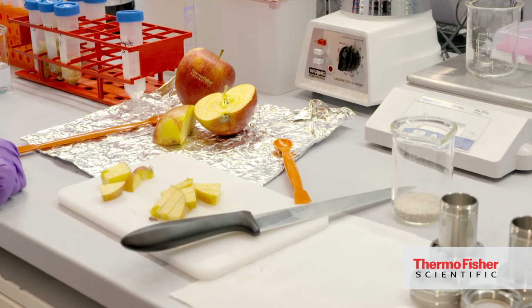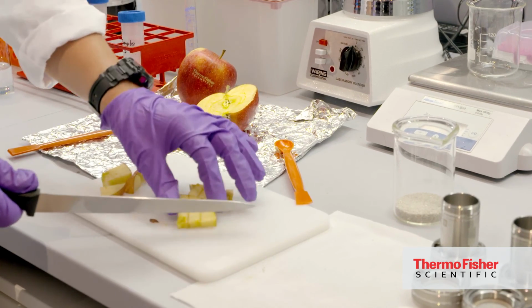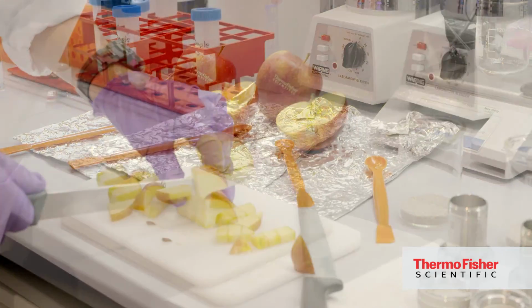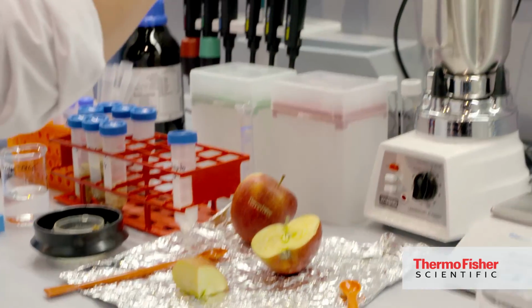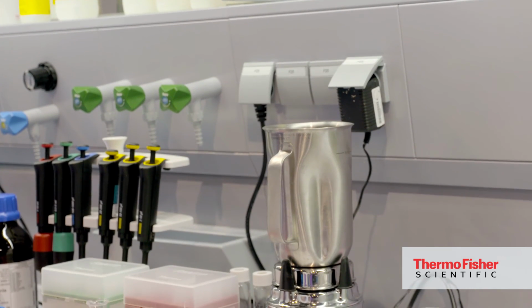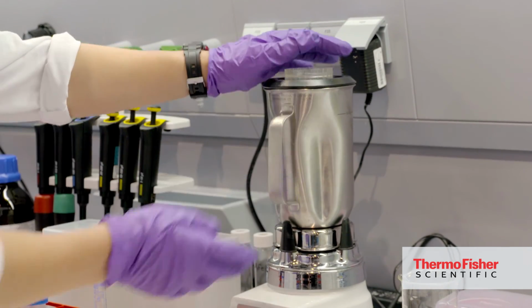So we are doing pesticide analysis, and for that, first of all, we take an apple, the sample, and we chop it, making ready for the homogenization. So the chopped sample will be put into the blender. This is like a normal kitchen blender. And like at home, we just put it on.